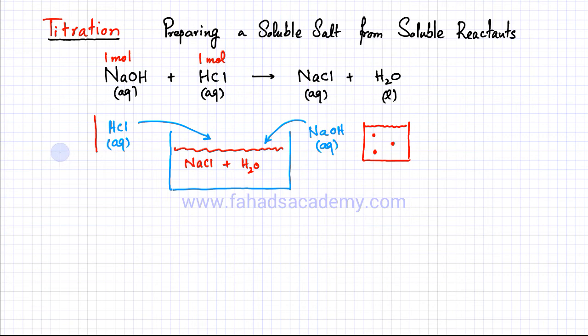So I'm going to take another beaker of, let's say, HCl. Now this HCl might be very concentrated. I'm using exactly the same amount, the same volume of both solutions. But the thing is, this solution might be too concentrated, which means that the number of particles per unit volume is a lot. So there's no way of actually counting the number of molecules.